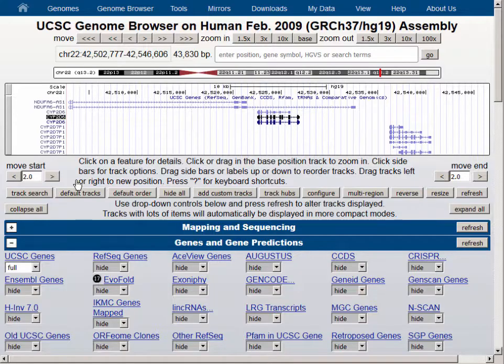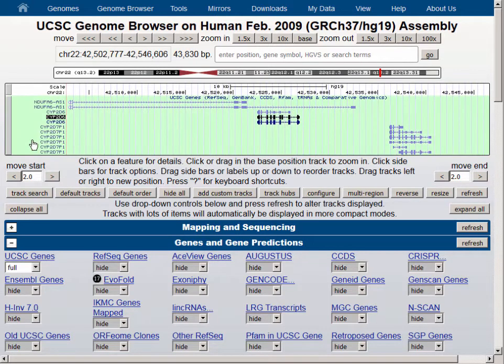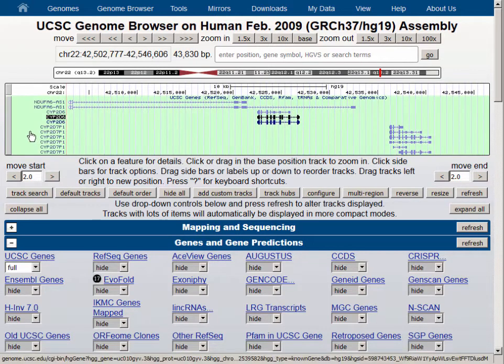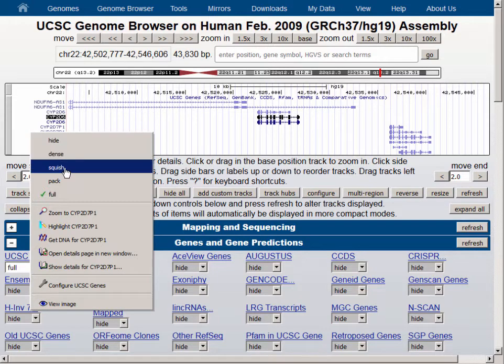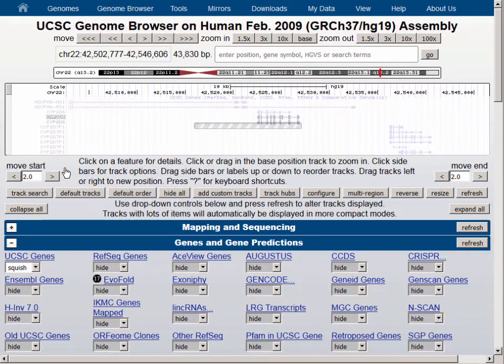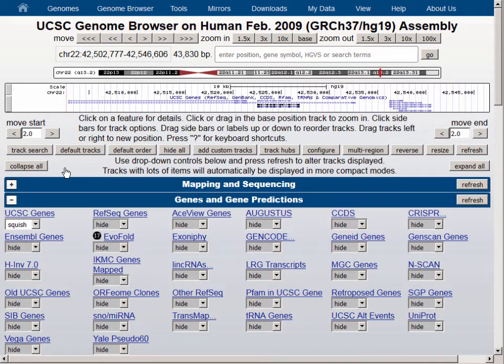The one remaining type in a typical gene track is Squish, which essentially squeezes down the Pack display into a much tighter display, dropping all of the item names and showing you just the individual isoforms in a very condensed fashion.